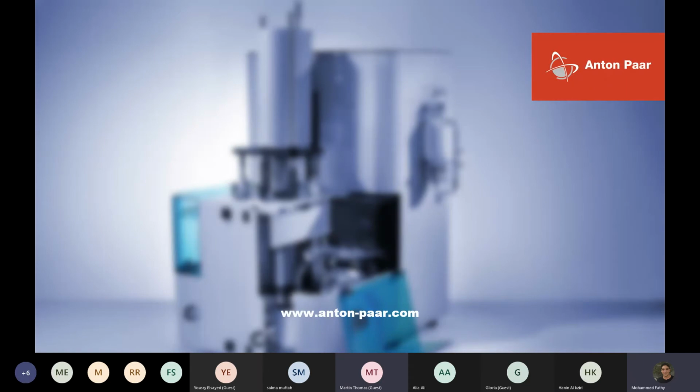At that point, what should the operator do about this potential? It's a tiny amount of mercury that's exposed, but still we want to stop that mercury vapor potentially escaping. All we have to do, and we supply a small syringe, is take a small amount of the hydraulic oil from a beaker and put about 50 microliters of oil on that mercury, and that stops the mercury vapor completely from the penetrometer.